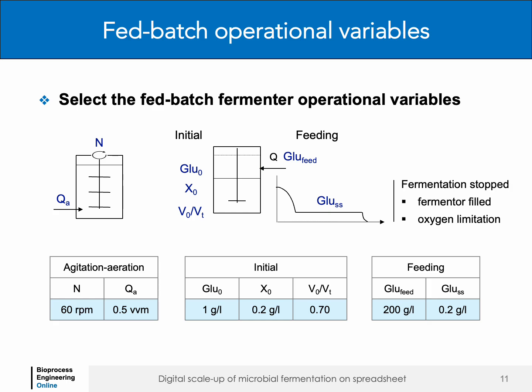The fermentation is terminated either when the fermenter reaches its maximum working volume or when the dissolved oxygen concentration falls below its minimum allowable level.